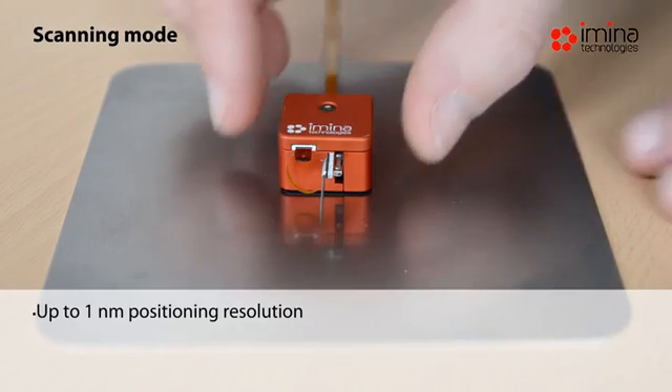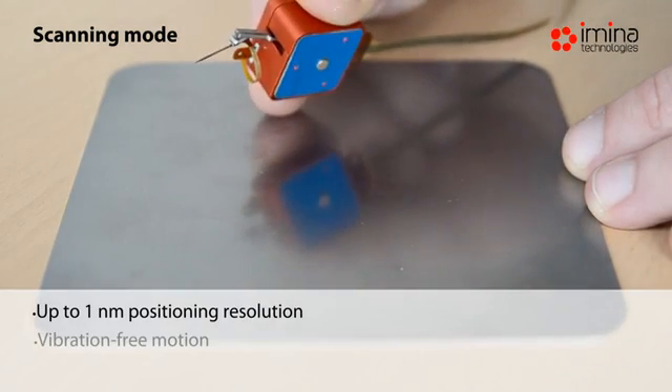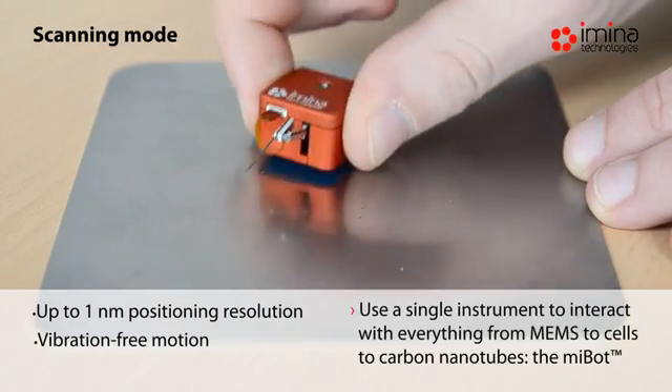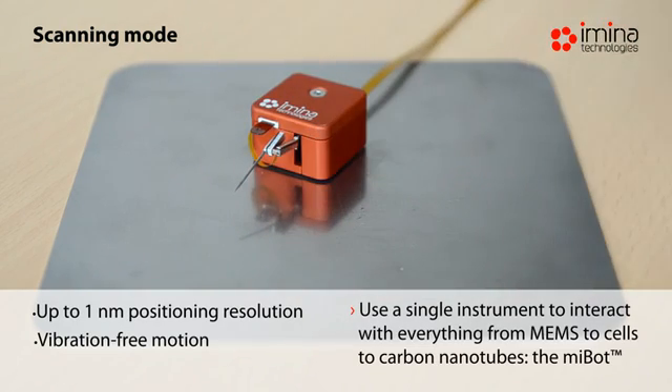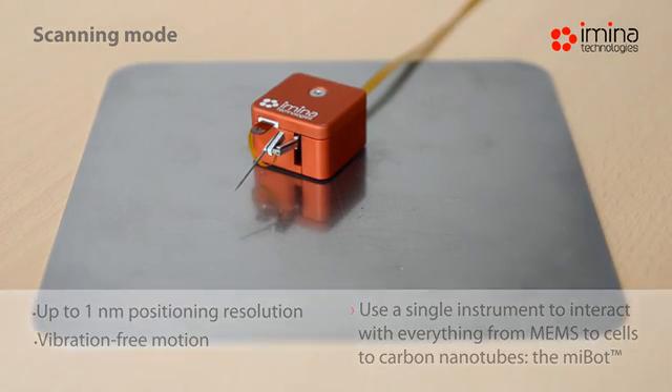In scanning mode, the three points of contact between the MyBot and the stage are held stationary. Only the MyBot body and its arm move over distances of a few hundred nanometers.